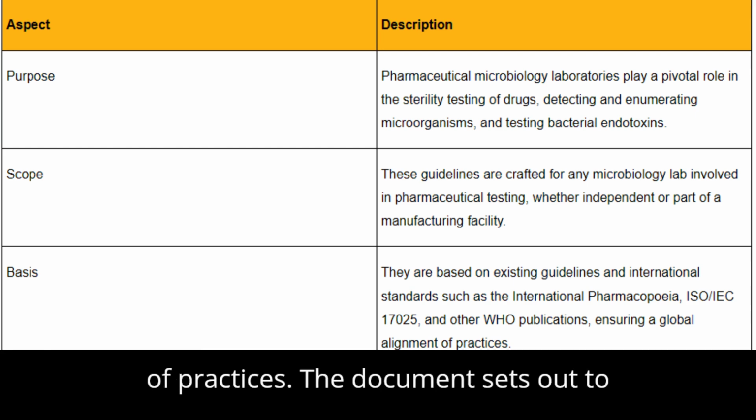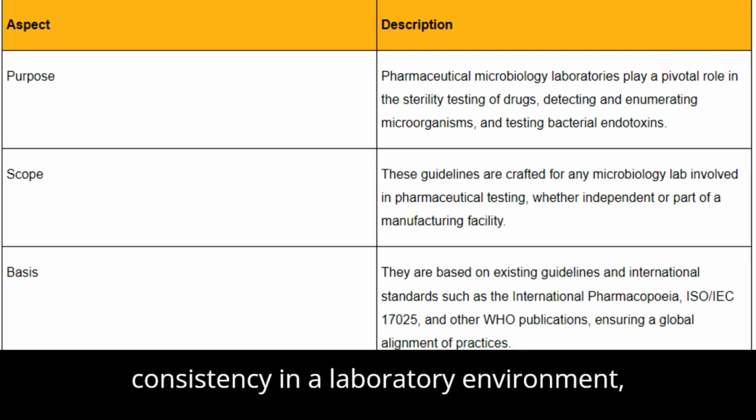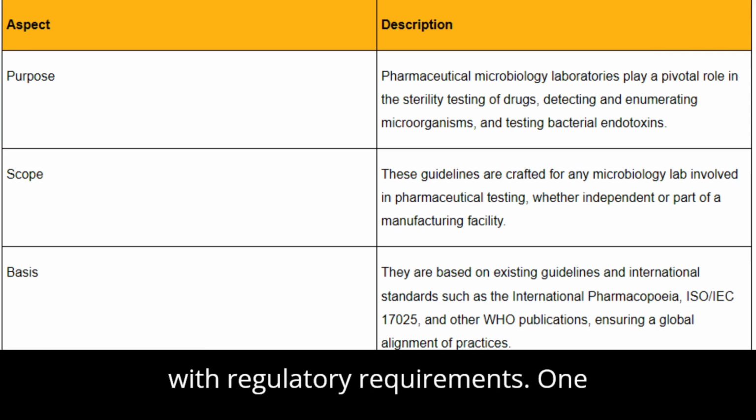The document sets out to reinforce the importance of maintaining consistency in a laboratory environment, equipment, personnel, and testing methods to achieve reliable results that comply with regulatory requirements.